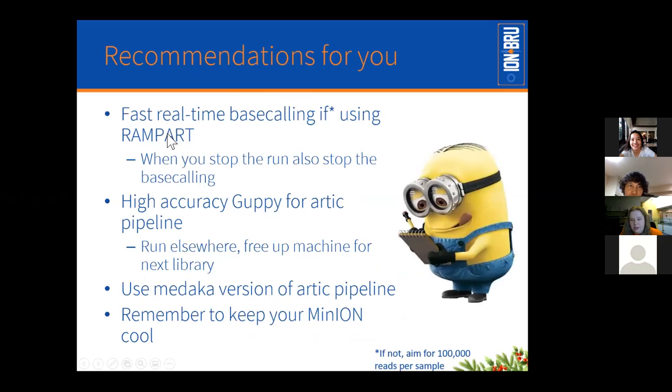So the recommendations for you guys specifically: use your fast base calling if you want to use Rampart. If not, you're aiming for 100,000 reads per sample. You want to use high accuracy Guppy for the pipeline. You want to use the Medaka version of the pipeline. There are 2 versions of the pipeline, and the Medaka one is much faster. And remember to keep your MinION cool. That is the main message for the actual wet lab side, I think.